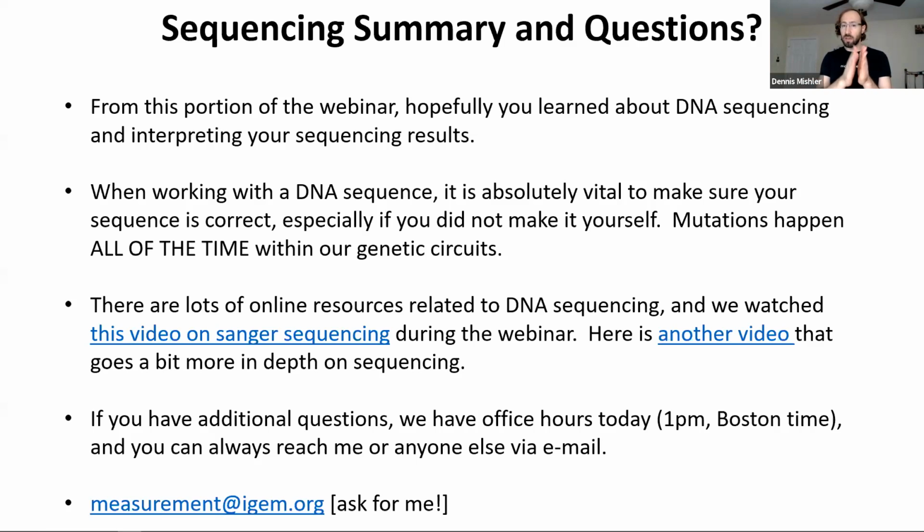The reason is that the first 20 or 30 nucleotides will give you really hard to interpret data. So the second sequencing result will start really around 730, 740, 750, giving you some overlap from the first read. Then it'll keep going from 750 to hopefully 1200, 1300, 1400, and so on. So yes, exactly like you said, design a different primer that matches not the very end, but about 50 nucleotides before the end of your first read. That would be how you would design that.